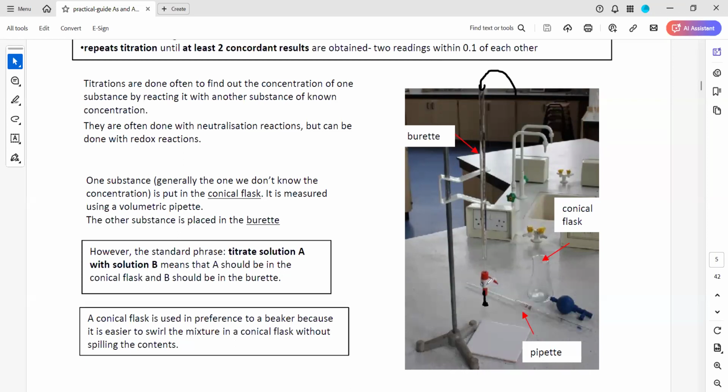You will see a level like this. The black line represents the liquid, an acid, but the jet is not completely filled. So you just run down additional acid. When you run down additional acid, the air will also be removed, till the jet also has acid.